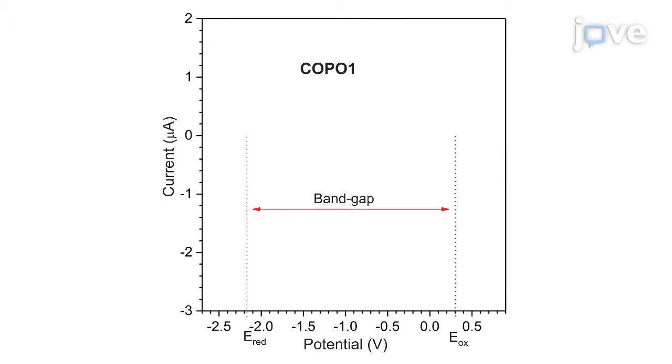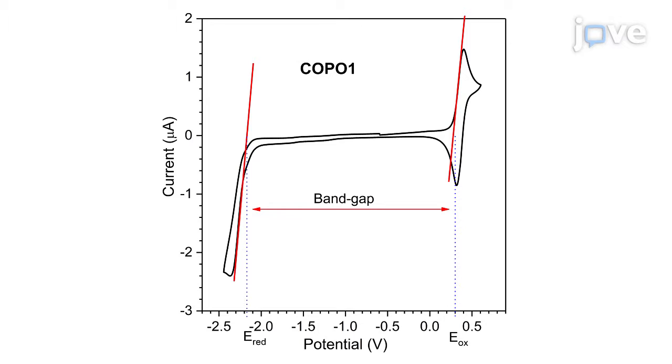The onset potentials of both reversible and irreversible processes can be estimated from calculations based on the intersection of lines tangent to the CV peaks with the background, adjusted for the reference material.